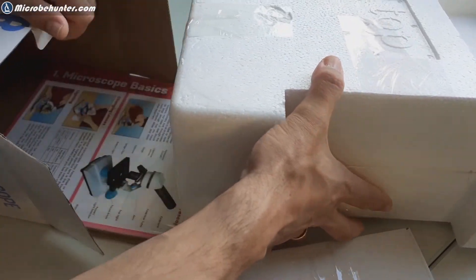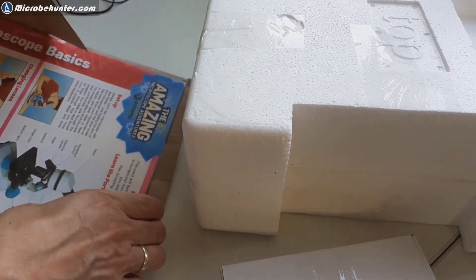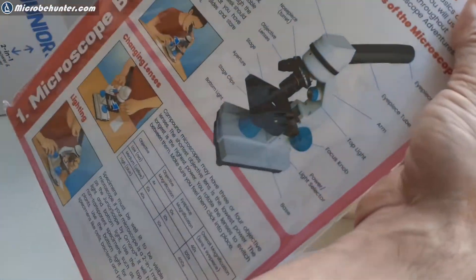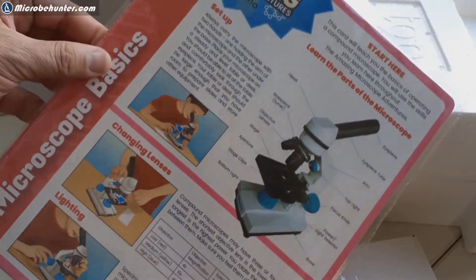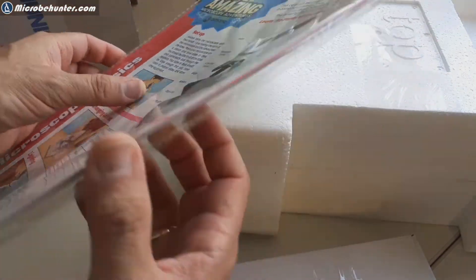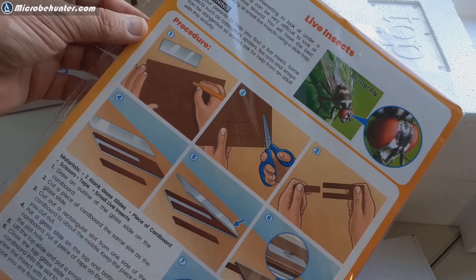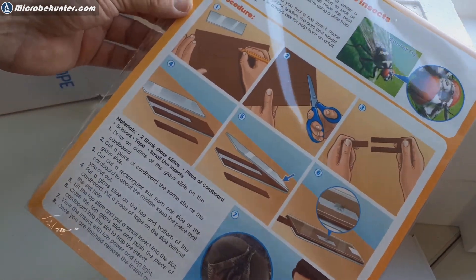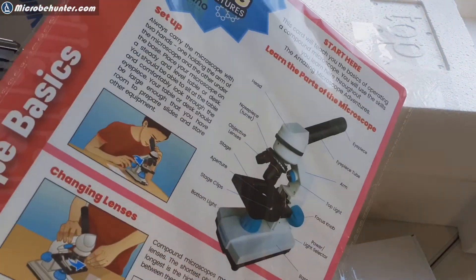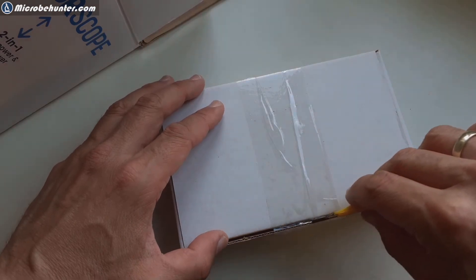But I also found out that there are some nice colorful cards here and they basically describe a variety of microscope activities that you can do with children or on your own if you are already grown up and this is the first time that you're confronted with microscopy.